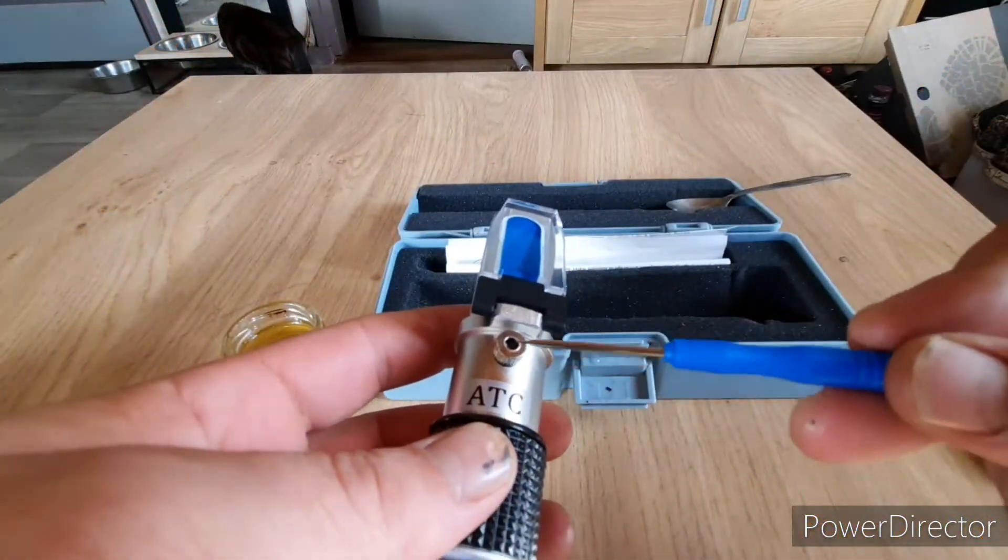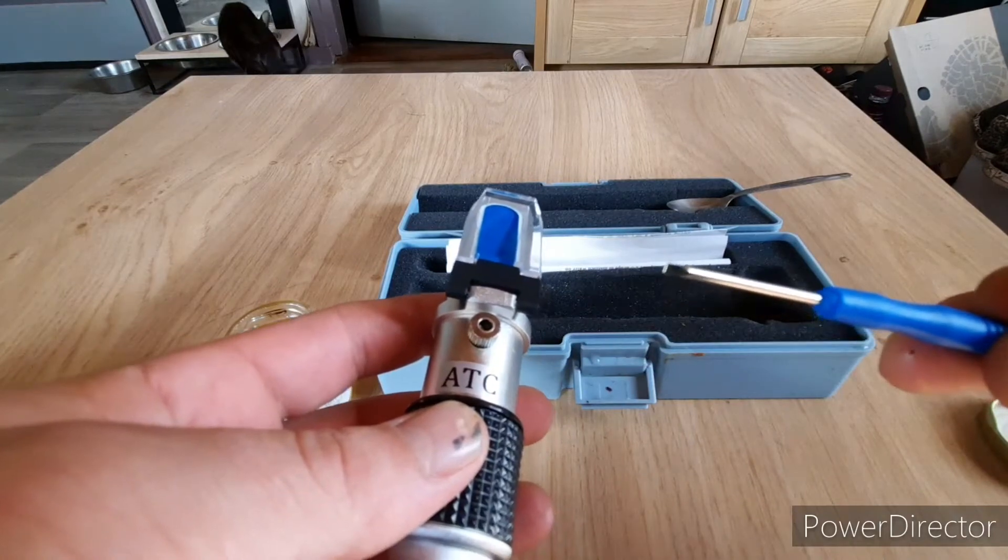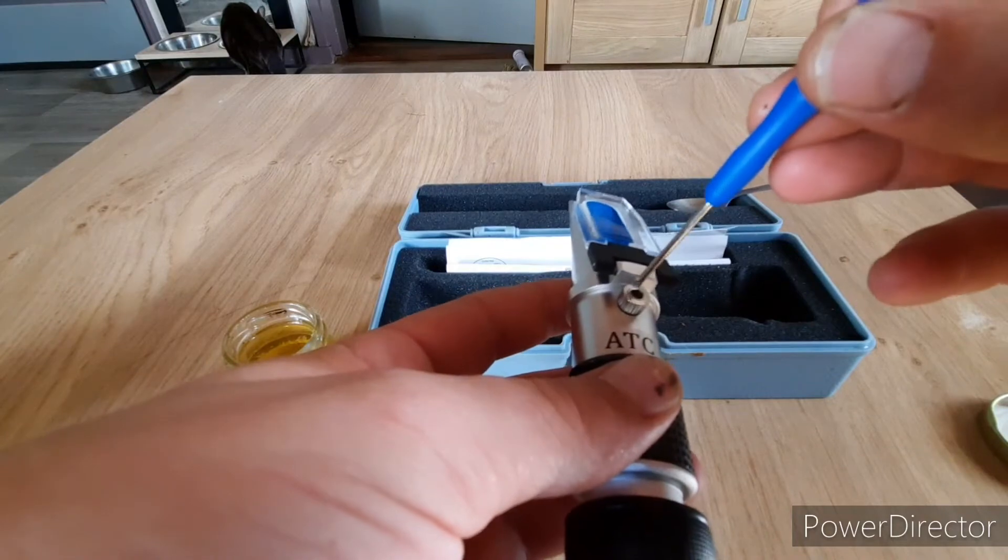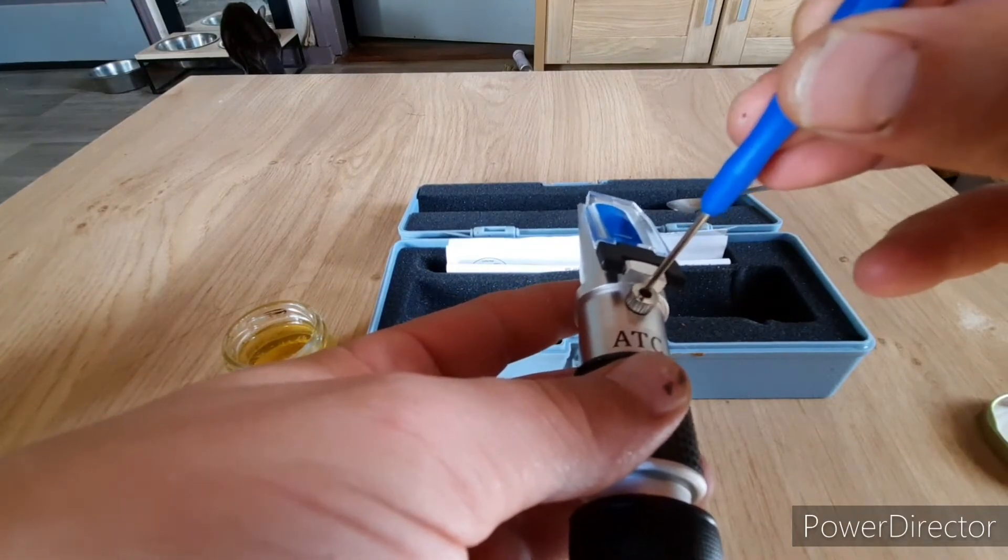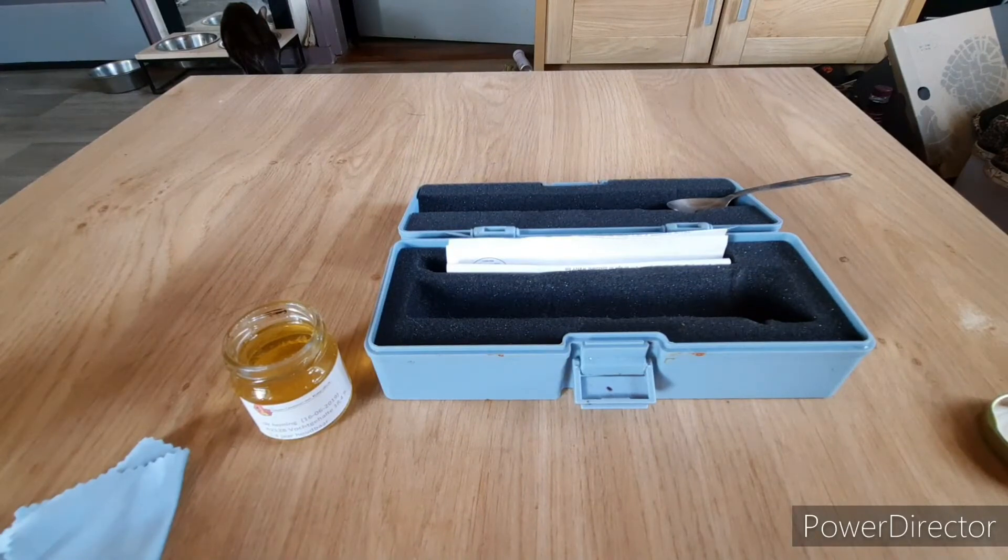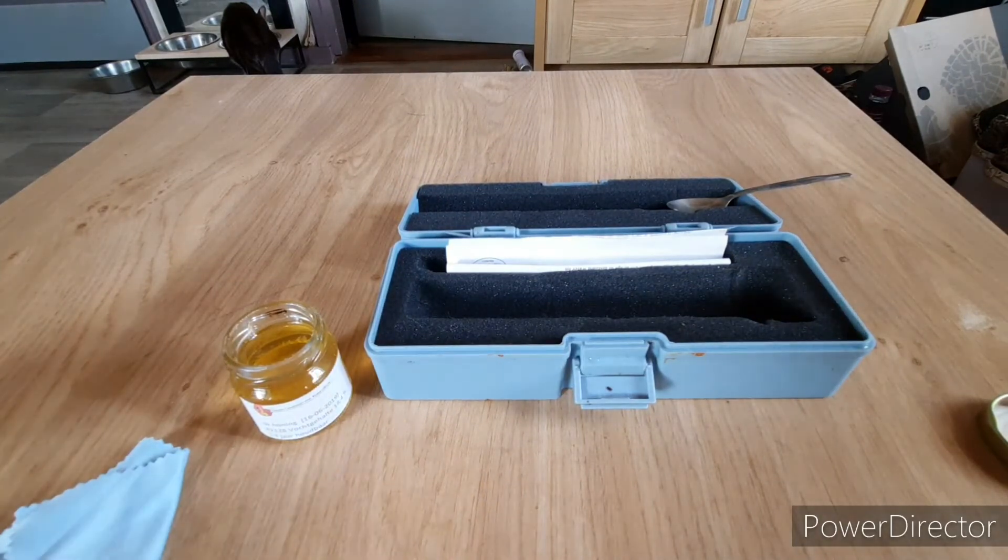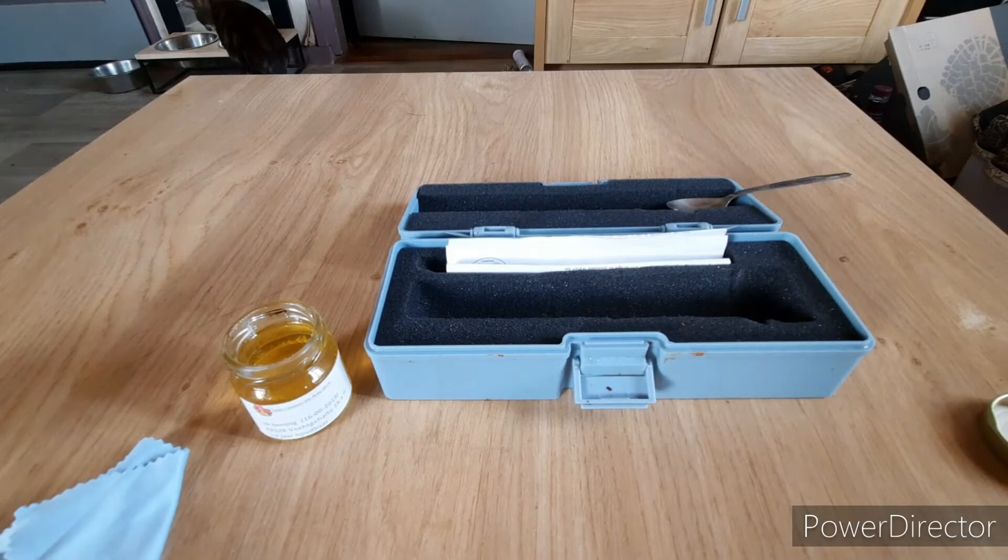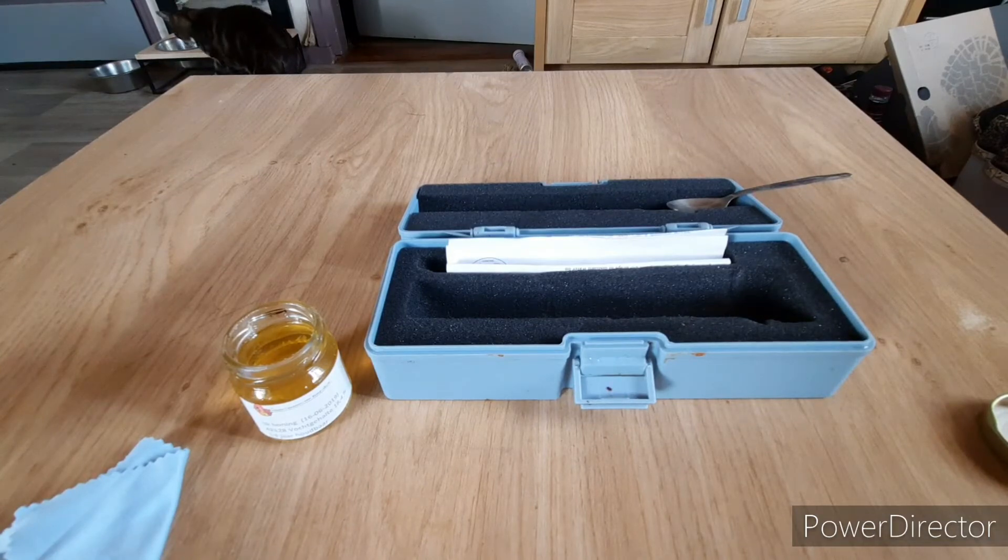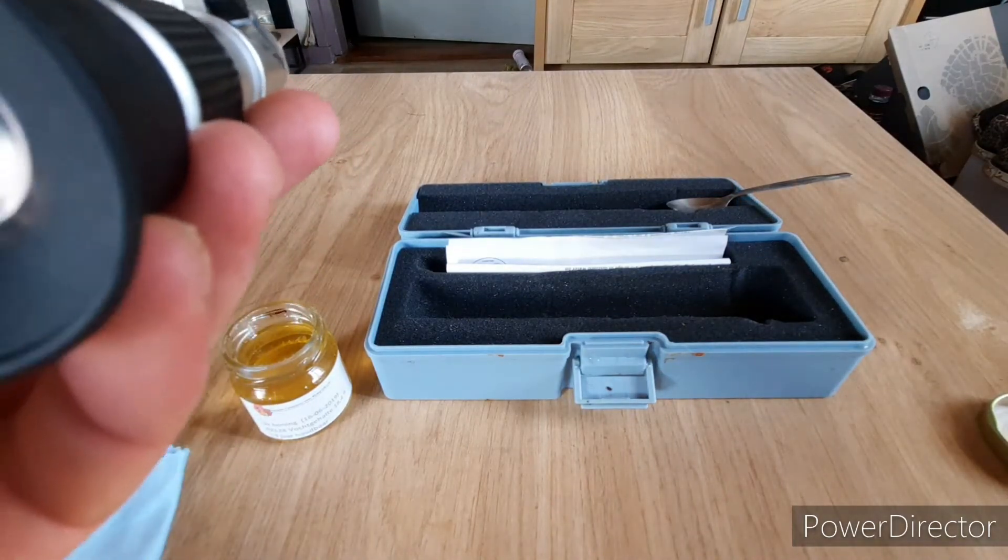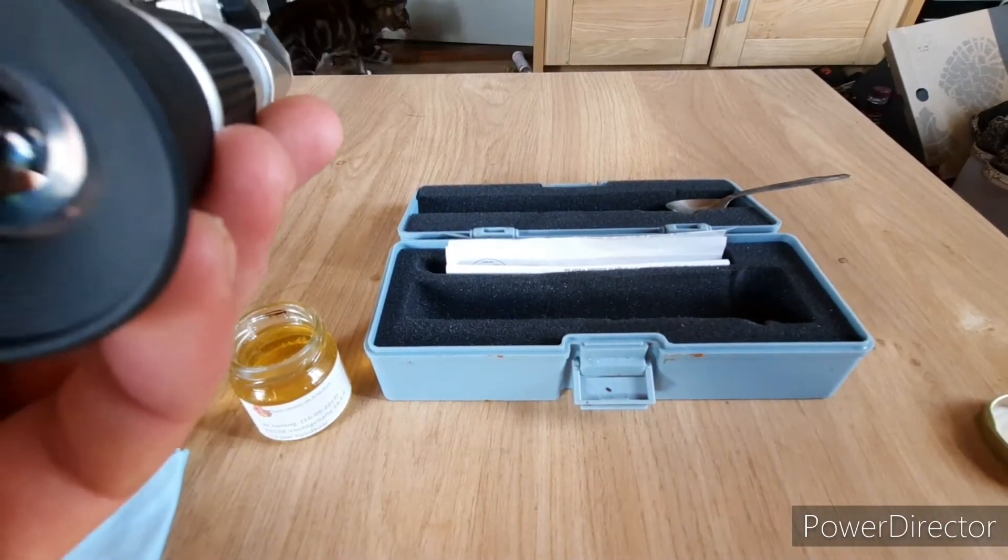There's a little screw here. You've got a tiny screwdriver, you're gonna put it in. I'm gonna turn it and check with my eye till the table shows 18.4 or close to that. Well this is it, let's have a look.